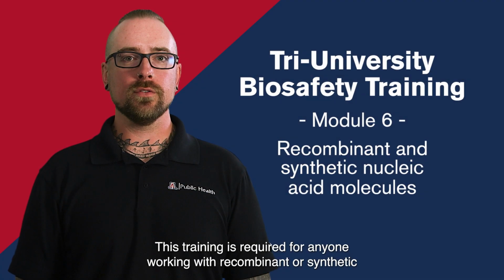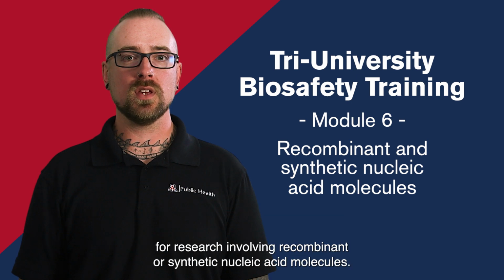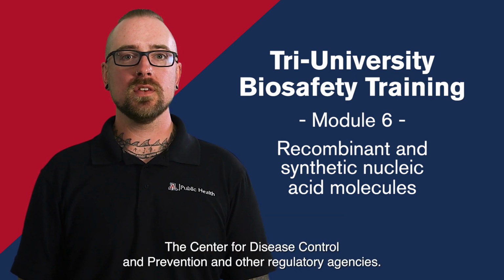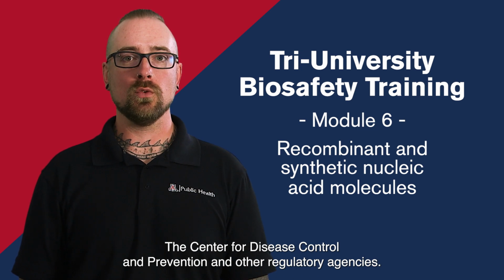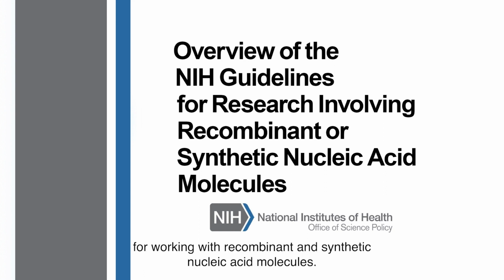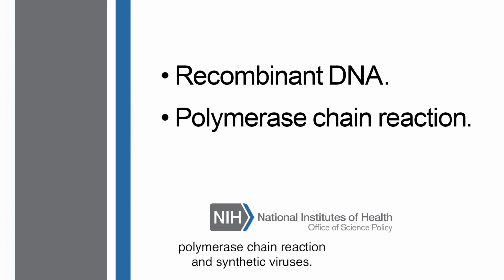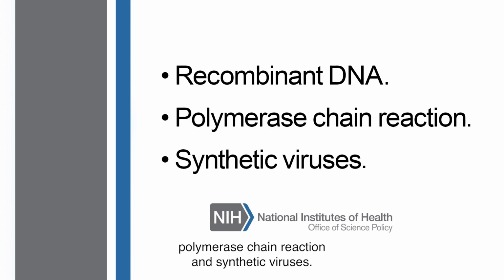This training is required for anyone working with recombinant or synthetic nucleic acid molecules to comply with the National Institutes of Health guidelines for research involving recombinant or synthetic nucleic acid molecules, the Center for Disease Control and Prevention, and other regulatory agencies. The NIH guidelines describe the practices for working with recombinant and synthetic nucleic acid molecules. Examples include recombinant DNA, polymerase chain reaction, and synthetic viruses.